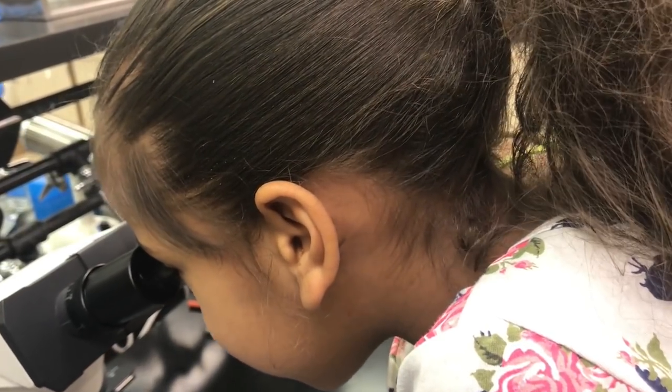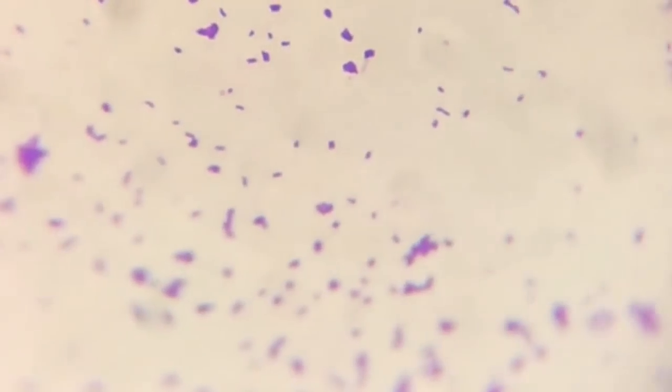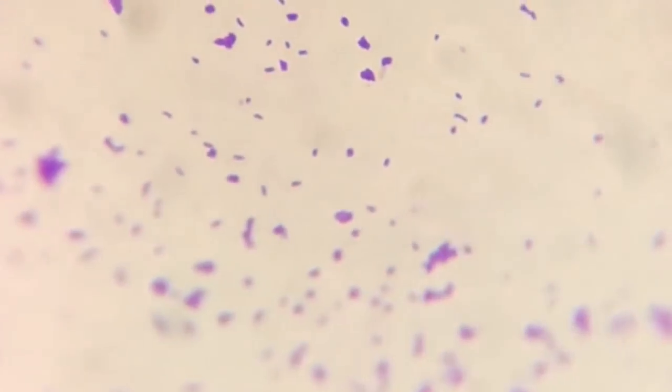Whoa, super tiny and lots of dots. All right, so let's see what this is. Okay, I see some clusters. They look like short rods. Yep, there's some rods in there. Rod-shaped bacteria is what we call bacilli. There's different types, like E. coli is a rod. I mean, it could be anything.